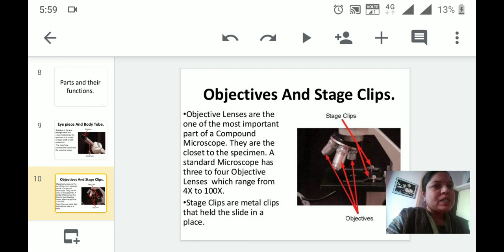Objective lenses are one of the most important parts of the compound microscope and they are very close to the specimen. A standard microscope has three to four objective lenses. The microscopes that are present in our biology lab have three objective lenses: one is of 10x resolution, second is of 40 or 45x, and third one is of 100x. Stage clips are the metal clips that hold the slide in place.